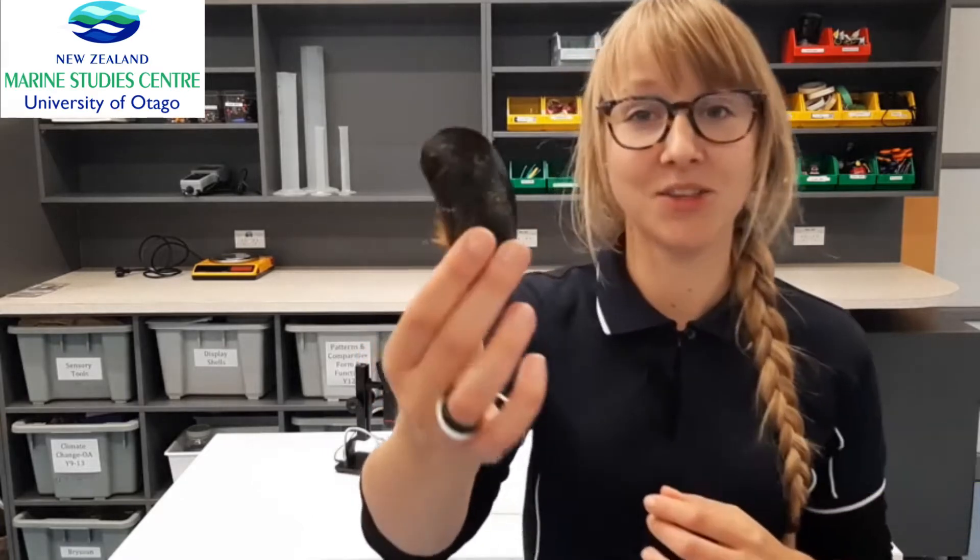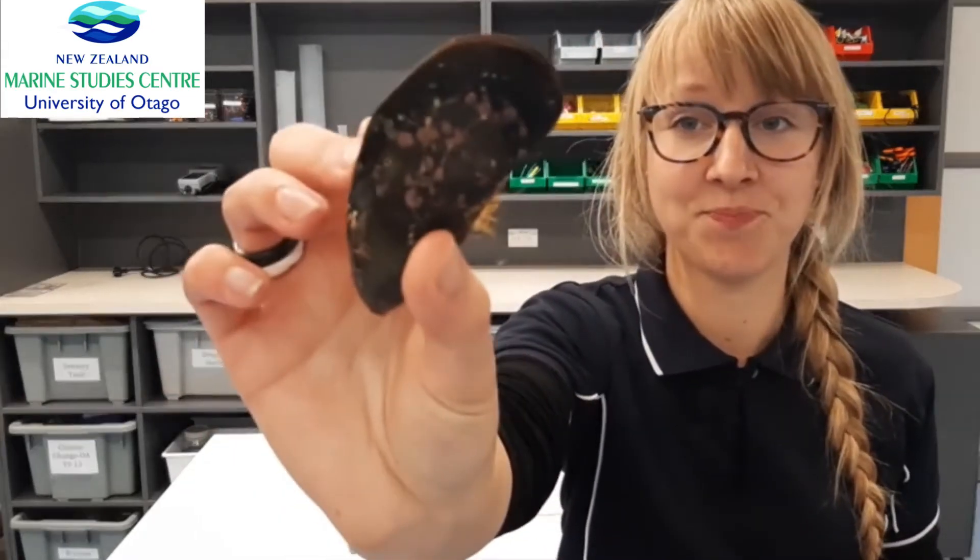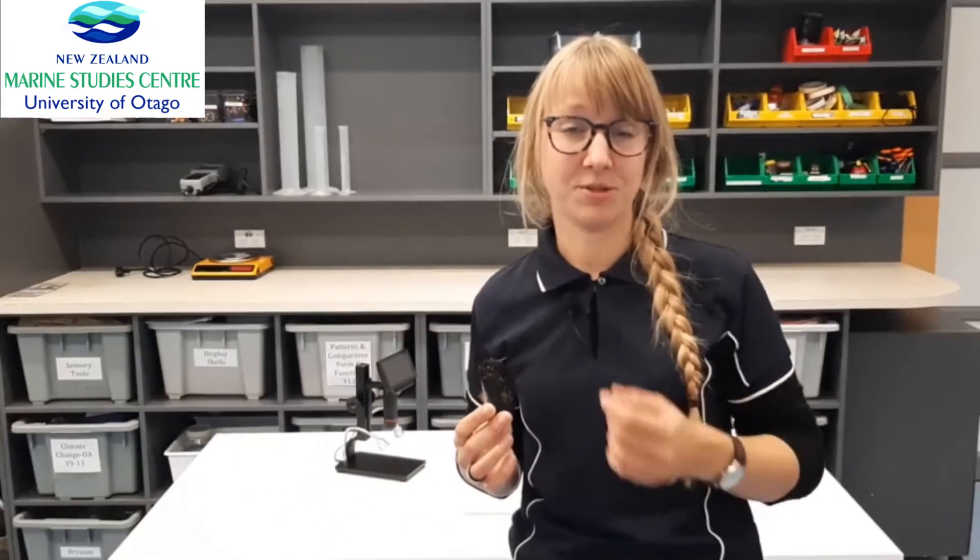We'll now be having a closer look at the anatomy and adaptations of mussels. I'll be using the green lip mussel from New Zealand. If you're working with a different species for your investigation, you can still use this video as reference material, as both the anatomy and adaptations of mussels are quite similar between species. So let's get started.